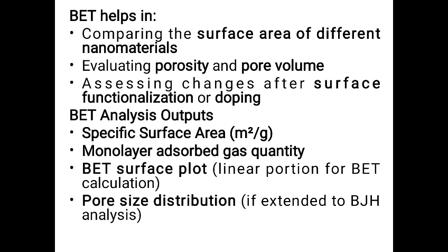BET analysis outputs are specific surface area in meter square per gram, monolayer adsorbed gas quantity, BET surface plot, that is a linear portion for BET calculation, and pore size distribution.